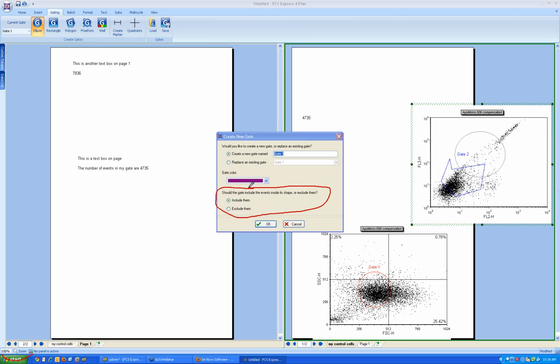So if you want to highlight the debris on your plot and then say this gate should exclude the debris, you don't have to make another gate that says not debris. The debris gate is a not gate by itself because it's behaving the opposite. Normally, the version 3 gates and in every other one is an include gate, and now we have these nice exclude gates.